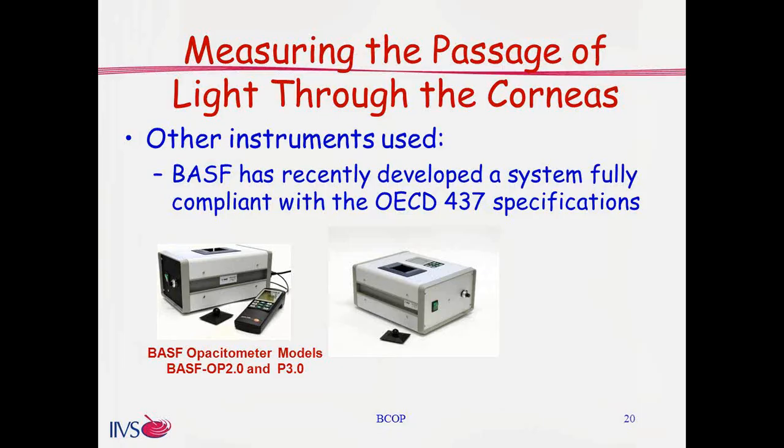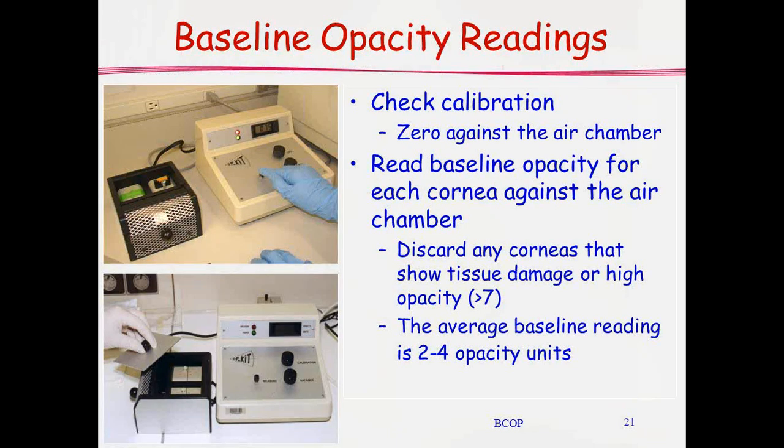They have also built a series of corneal holders to, again, meet the OECD guidelines specifically. And Susanna will give a bit more detail on this equipment in her presentation a little bit later.